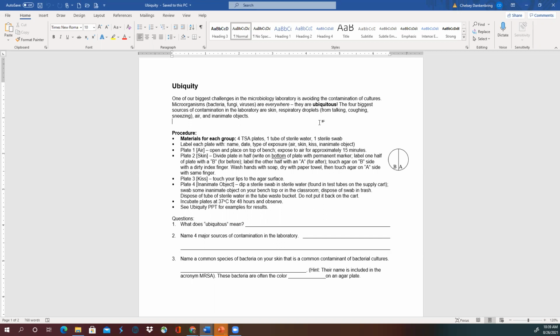Okay, so a lot of times we don't talk, and to be honest, I had some critical experiments where I wouldn't even breathe if I had a test tube open or a petri dish with an agar plate open, because I did not want to risk the integrity of my experiments. You just kind of hold your breath a little bit. Another form of contamination is the air, because again, there are microbes everywhere. As you saw from that hand dryer photo, a lot of those came from the air.